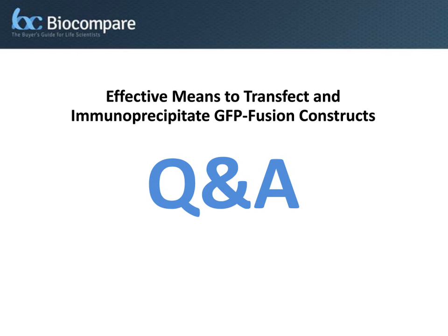It does typically require more volume to get up to the level necessary for that electrode to work, and that usually requires quite a bit more DNA. So the downside of that is that the DNA requirements are usually quite a bit higher.